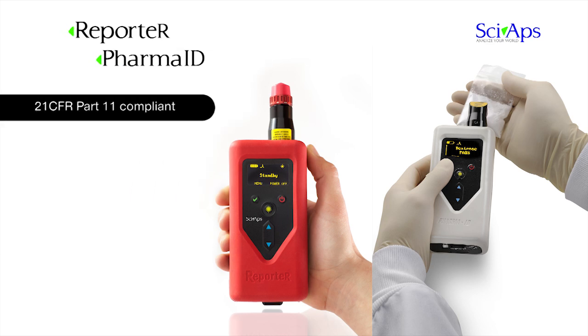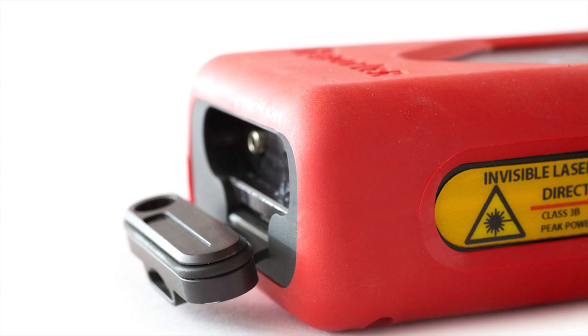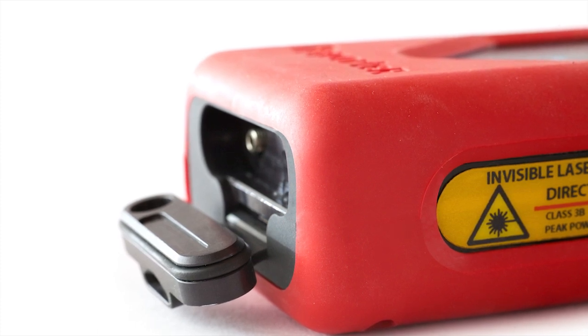The PharmaID is also fully 21 CFR Part 11 compliant. They are multi-use, easily transported, and can fit into a coat pocket or holster.